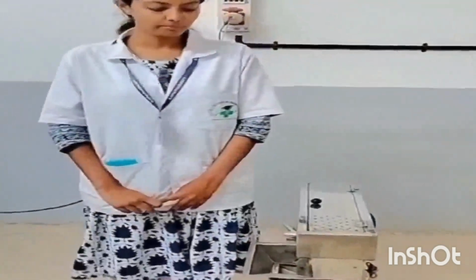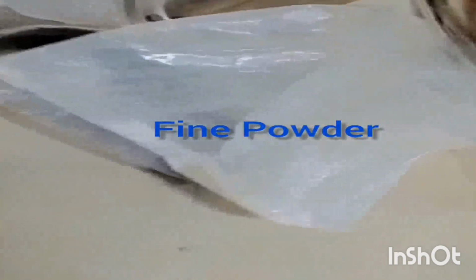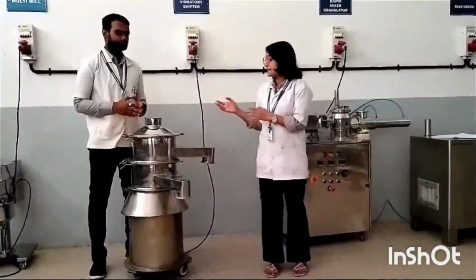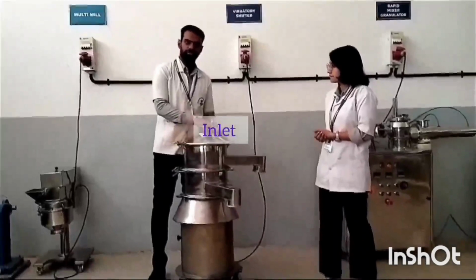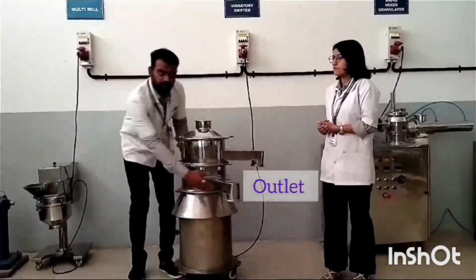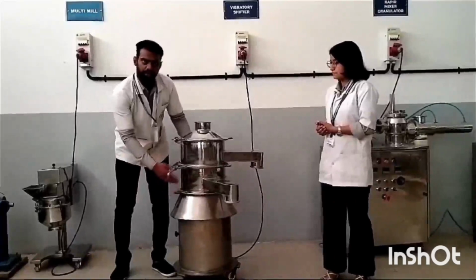Multi-mill consists of hopper inlet, milling chamber, discharge point. The machine works on the principle of vibrations. The material is separated based on the particle sizes. The material is added through the inlet, where it passes through the two sieves. First sieve and first outlet is for the coarse particles. Second sieve and second outlet is for the fine particles. And the sieves can be changed according to the desired size.